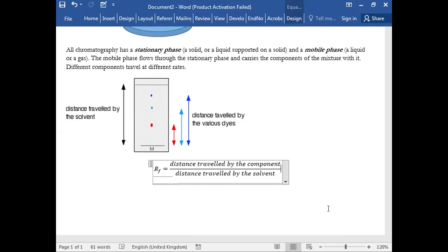Is this clear? बिल्कुल, it is used to recognize component. यही तो कह रहा हूँ, if a particular example, different condition है, तो RF वैल्यू चेंज हो सकती है. तो अगर RF value change हो सकती है, तो हम कैसे उस कंडीशंस के हिसाब से RF वैल्यू देते हैं.